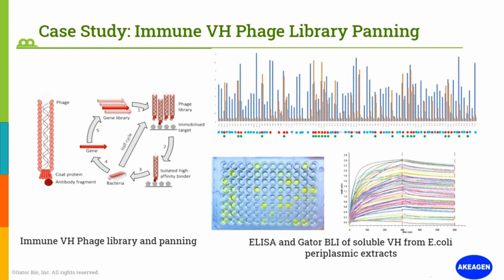From the right panel, we can see that after 2 rounds of panning, we get about 90% positive reads against the different parts of the immunogen, which is the cytokine or the Fc. So either cytokine or the Fc, or some clones that can bind to both cytokine A and cytokine B, because they belong to the same family and they are homologous. And this is the ELISA plate, showing the picture.